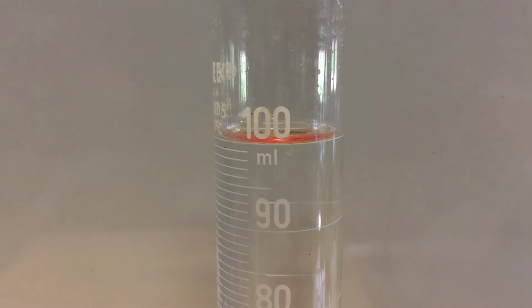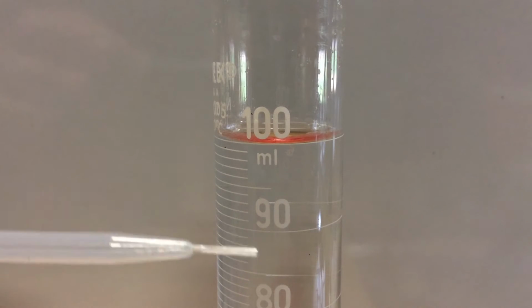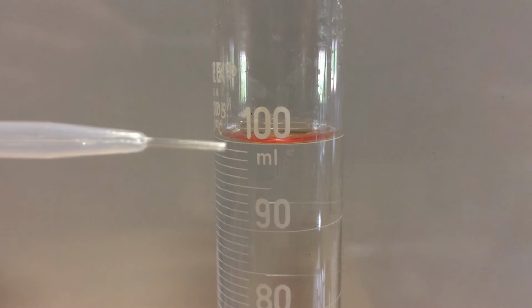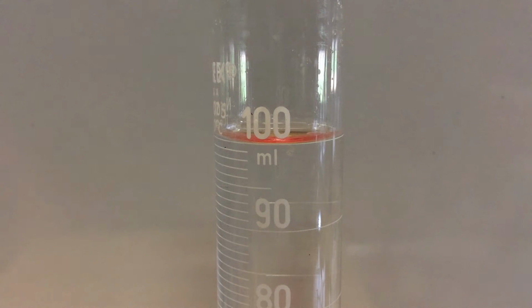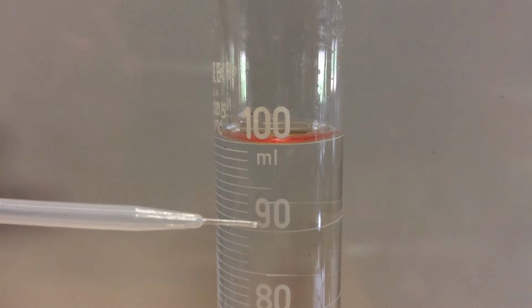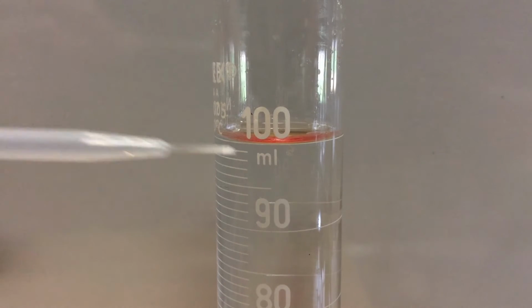And if you write 100 milliliters, I'm going to have to take points off in your lab because, wait a minute, if it's 100, then where's my guess? Is my guess in between the 90s? Well, I've got calibrations here, don't I, in between? If it's calibrated to the individual numbers, then let's pretend it was on a 99 in between 99. Then we would go 99 point something, right? So if it's calibrated into the individual milliliters, as I see here, this is 90, 91, 92, 93, 4, 5, then my guess has to be what?